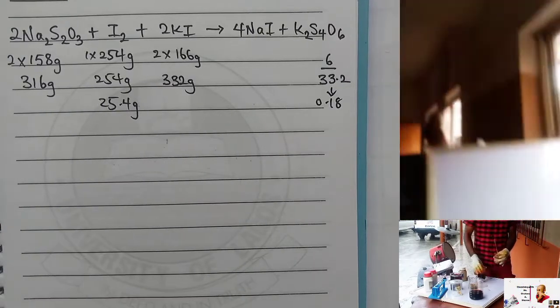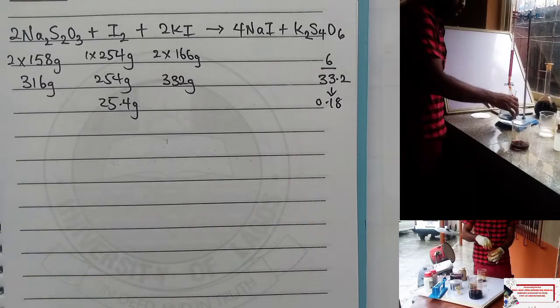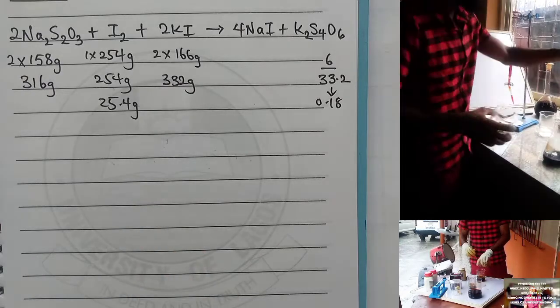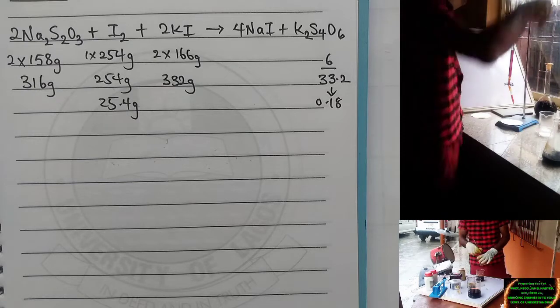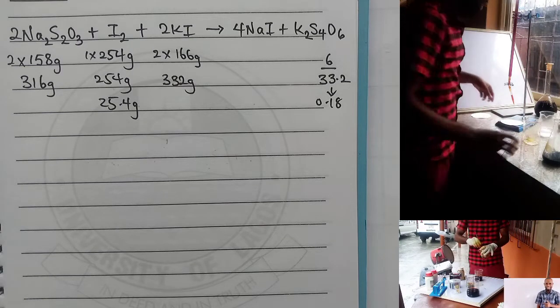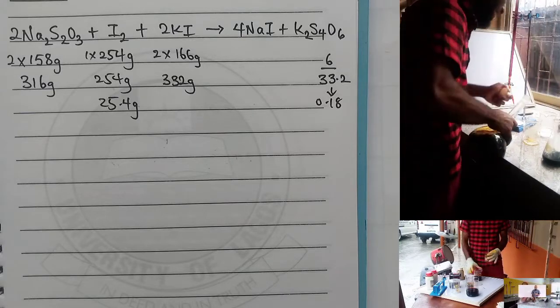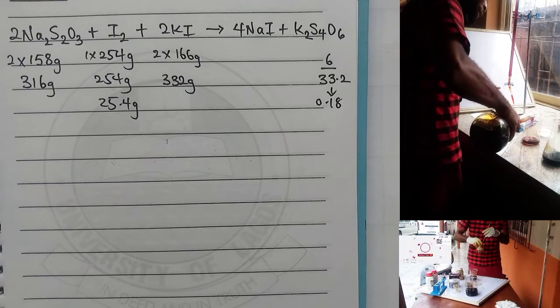If you look at it, you see that this might not be able to dissolve very well because of the low quantity. That means I need to grind those things using the glass rod, as you can see on the screen. That is what made the process of dissolving this to be difficult. I'm bringing this up so that you understand why it is difficult for that iodine to dissolve. You will notice that not all the iodine I used dissolved; I still have some remnant inside it.